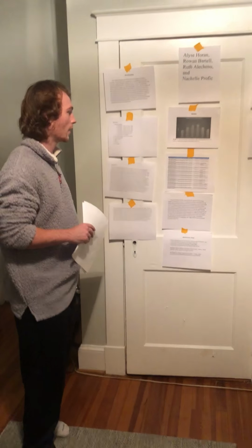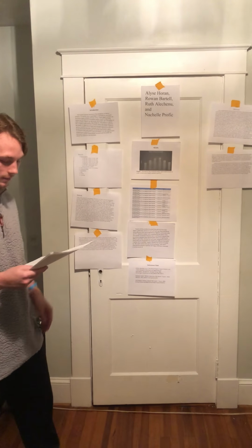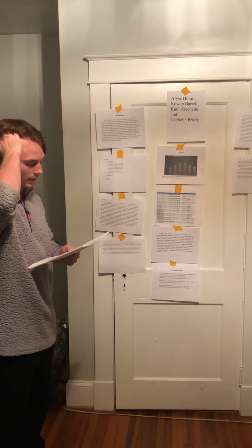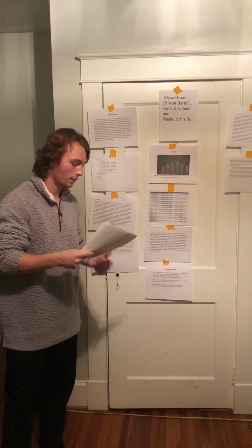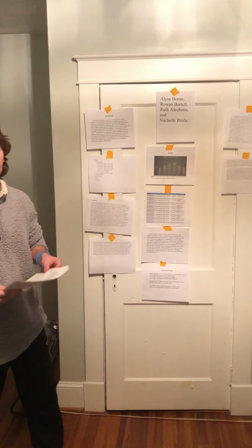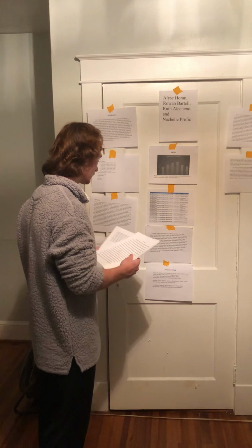Trypsin activity from pHs 8 to 9 varied by 6%, which is not a lot. So that's why the optimal value could possibly be 8 to 9, depending on more testing. While activity from pHs 9 to 10 varied by 25%, which indicated the enzyme's optimum range of 8 to 9, and a decrease in activity at 10.